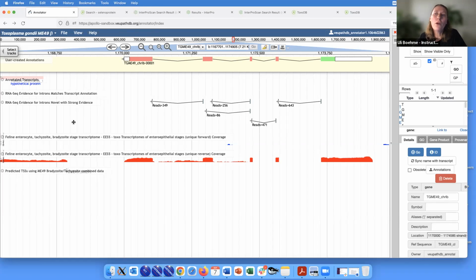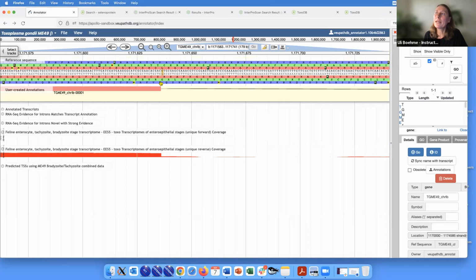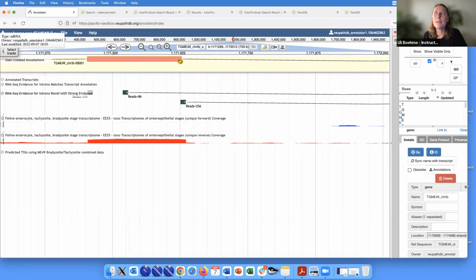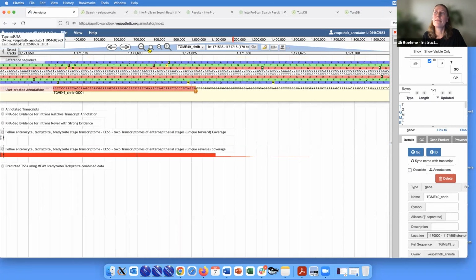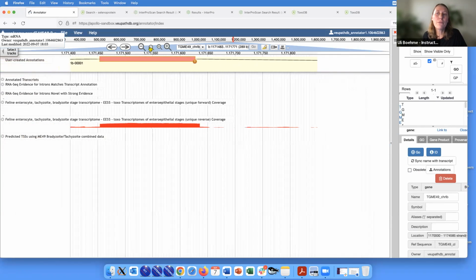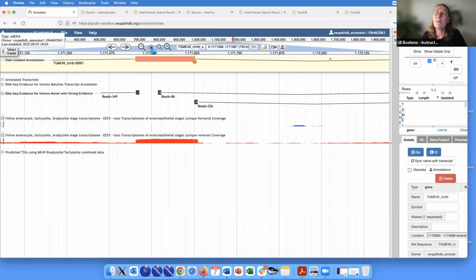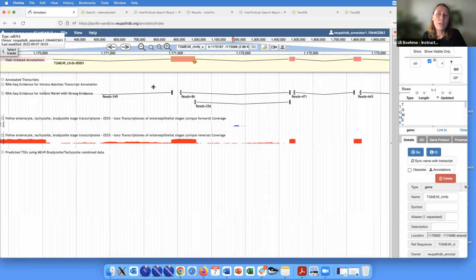I mean, Apollo also tells you if something is incorrect, and Gloria already mentioned that. One thing that can happen is that you see this exclamation mark, and this exclamation mark points to an incorrect splice site. In this case, you would just zoom in and check the splice site and see if it's a valid one. You can also see an exclamation mark for a GC splice site, and this is a valid one. But Apollo already tells you a lot, and also we have these automated checks.